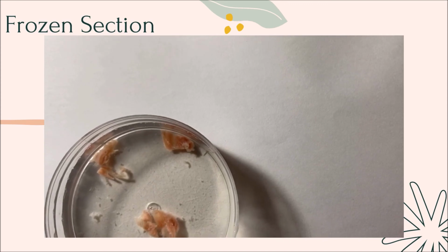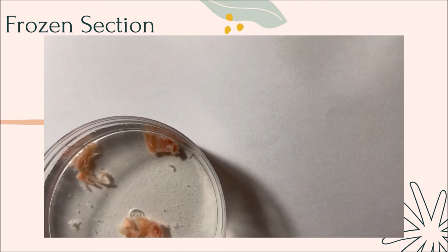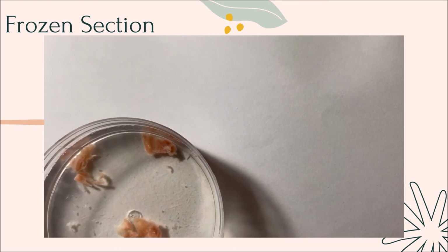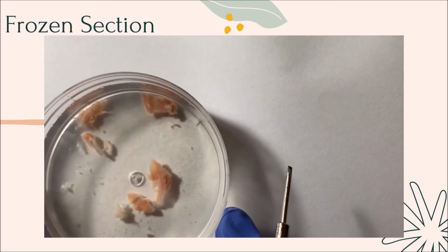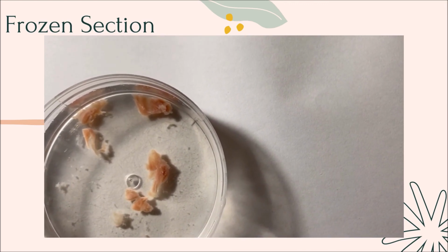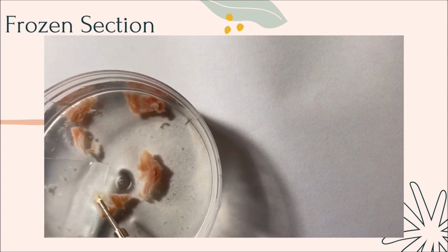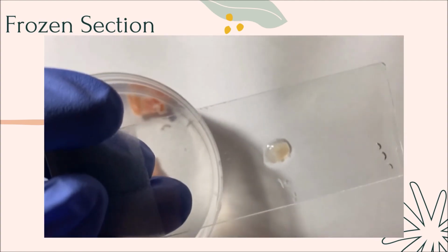So after using the cryostat, we would now be performing the teasing or the dissociation process. The teasing or dissociation process is done to carefully separate the structural parts of the tissue by means of a dissecting needle. We have already immersed the specimen in saline or an isotonic solution to prevent tissue distortion. After that, we would grab the dissecting needle and the glass slide, put it there, and then we would cover this with a cover slip.